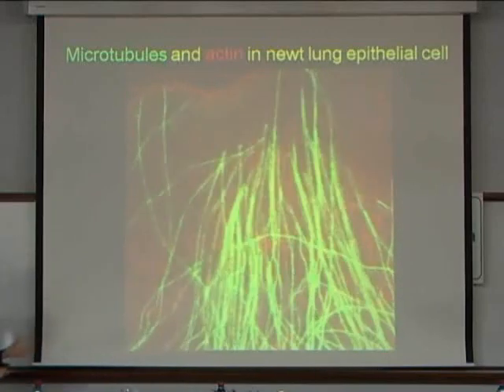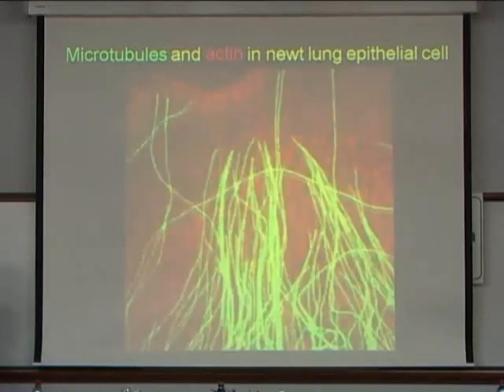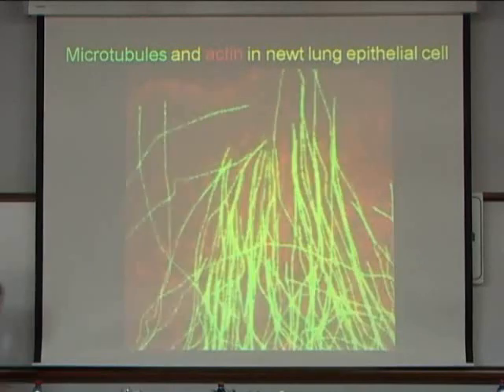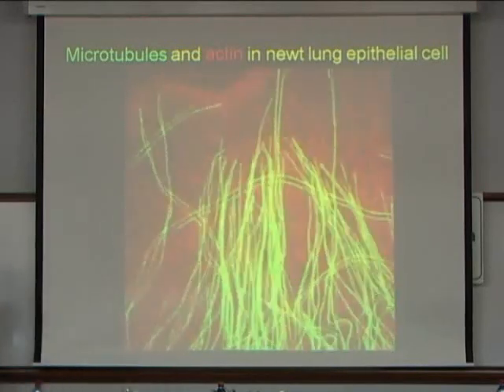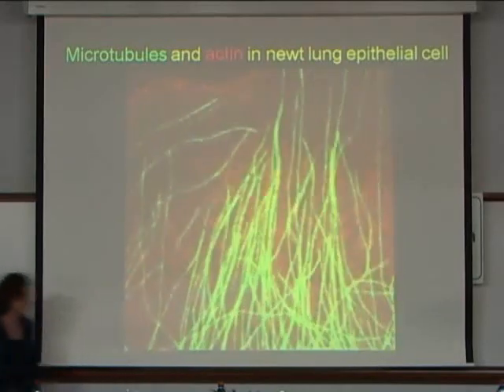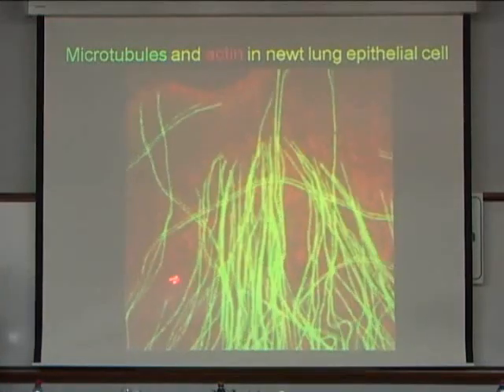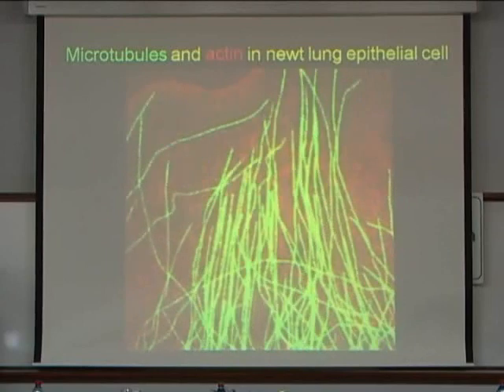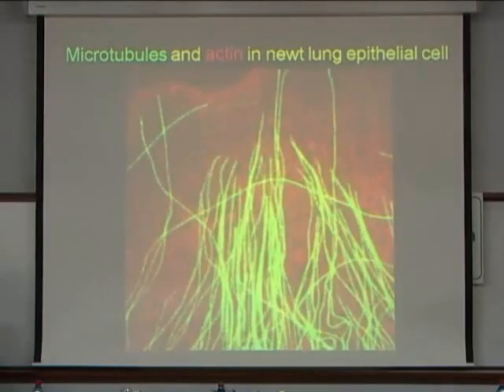The point that I want to make here is that the information density is huge. In each one of these images, there are about 1,000 data points. Over time, as you film these speckle dynamics, you're getting on the order of 500,000 to 1 million data points in a 10-minute time-lapse movie. Here, I was probably taking images at about 10-second intervals over the course of about 20 minutes. So we've got 500,000 numbers for you.